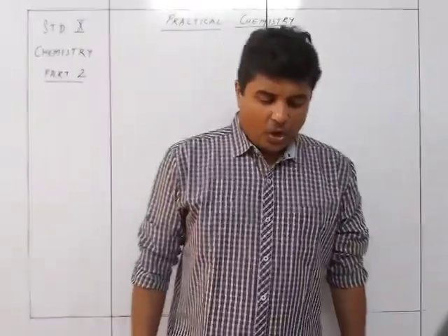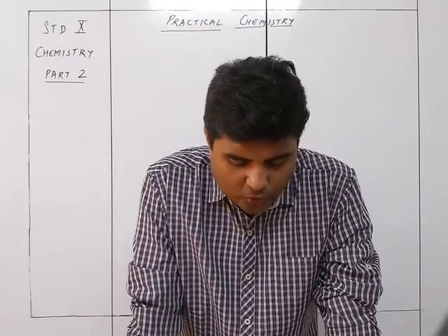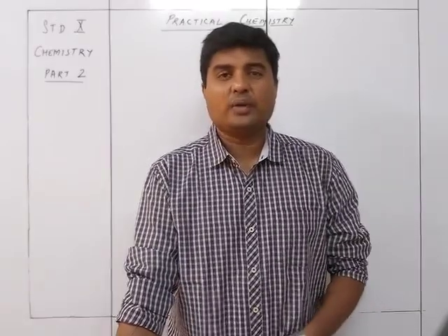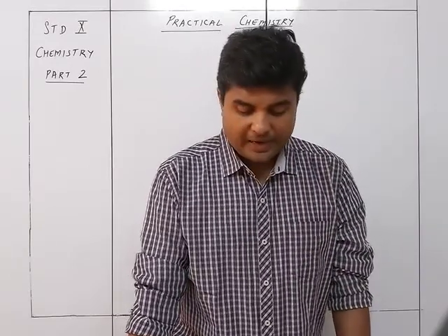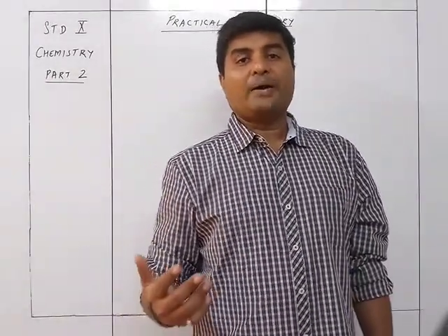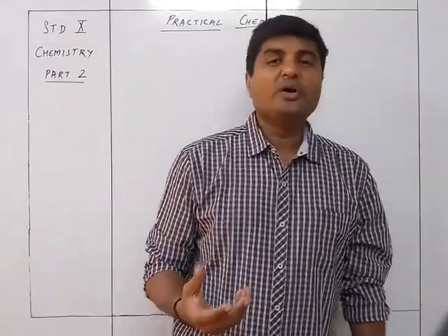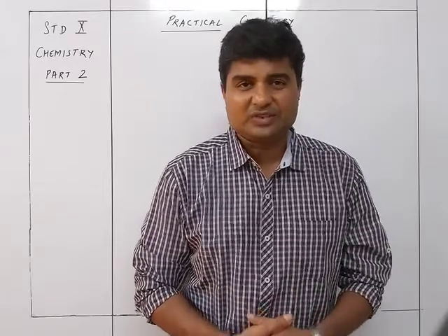Second part is on passage through copper sulfate solution, CuSO4, it gives a pale blue precipitate. That is, ammonia dissolves in water to give NH4OH, and CuSO4 plus NH4OH gives you (NH4)2SO4 plus Cu(OH)2, which will be a pale blue precipitate. Now this is exactly what we did in analytical chemistry as well as during the chapter on ammonia. When ammonia reacts with copper sulfate, it is going to turn into a pale blue precipitate of copper hydroxide, and this is going to be soluble in excess of ammonium hydroxide.